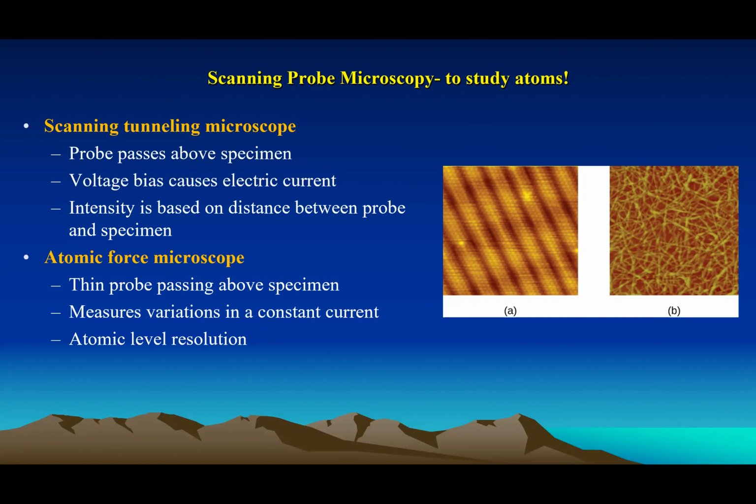Atomic force microscopy, here the probe is also passed above the specimen. This measures the variations of the current, and the resolution is atomic level.